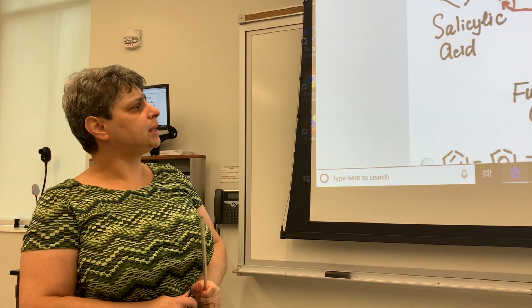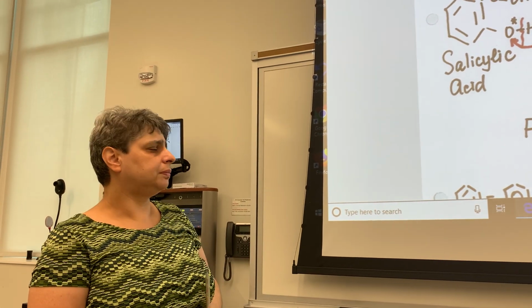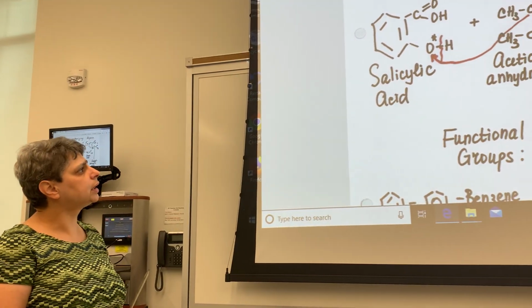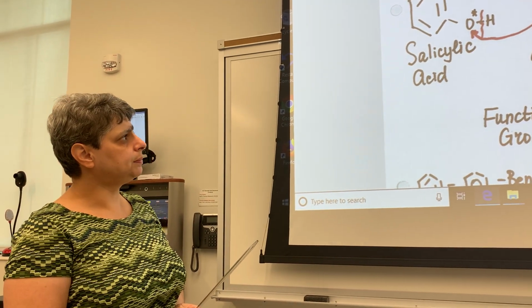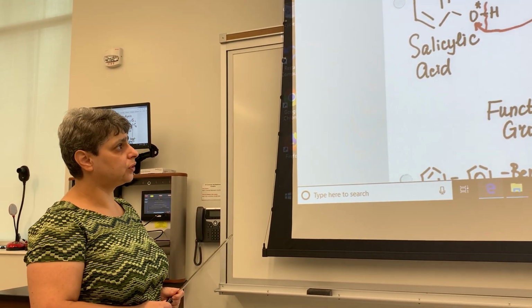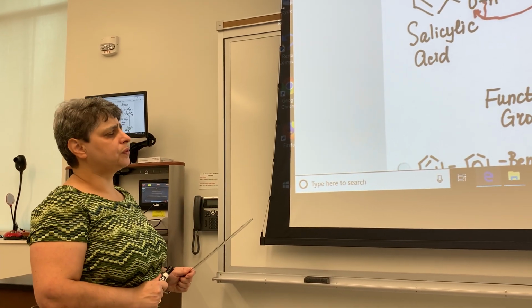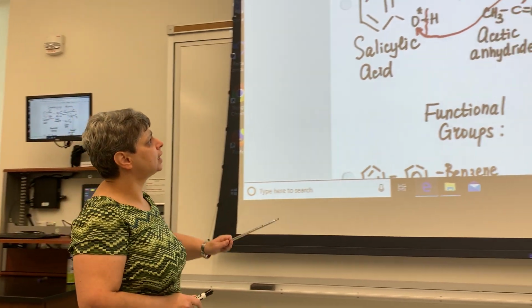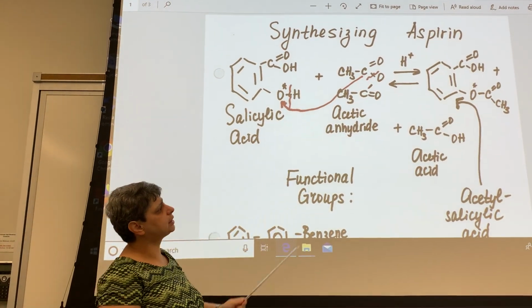So it's based on different solubilities of desired product and undesired product in a certain solvent. For us, that solvent will be alcohol, ethanol to be specific, or ethyl alcohol. It's a well-known fact that salicylic acid dissolves in ethanol better than acetylsalicylic acid.